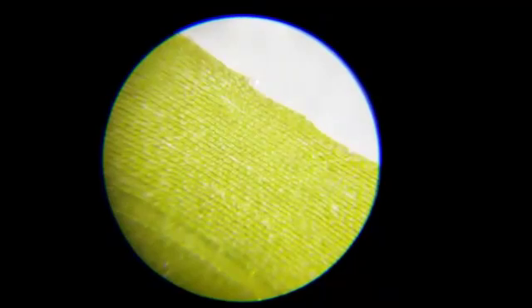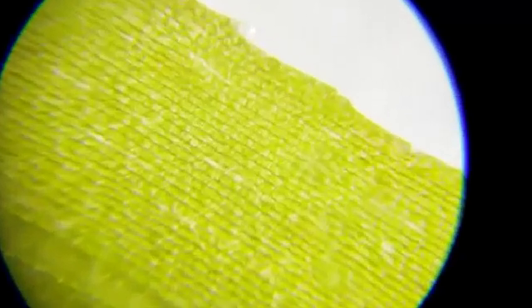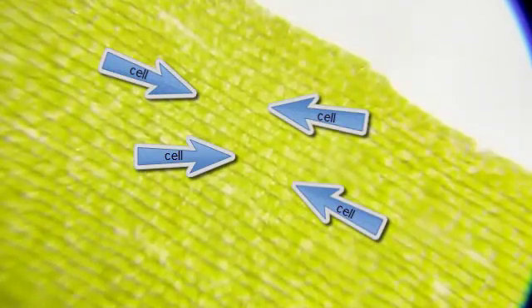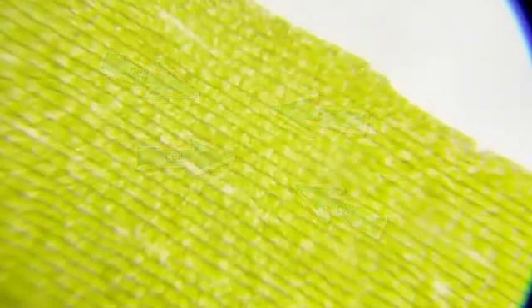All right, so you can see what I'm talking about a little bit here. You can see all the individual green rectangles. But then inside of each rectangle, there are distinct green spots. And each one of those green spots that you're seeing is a chloroplast.